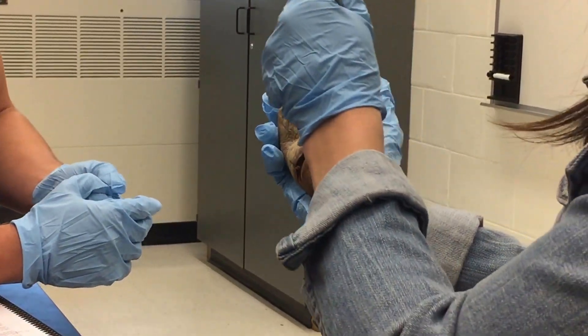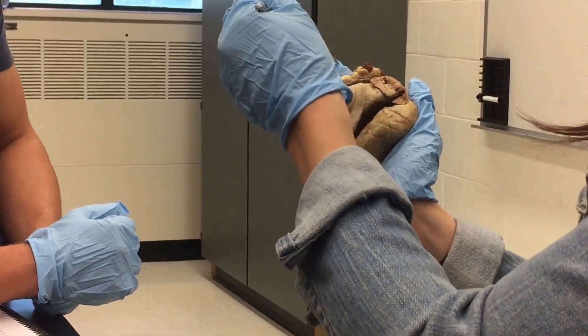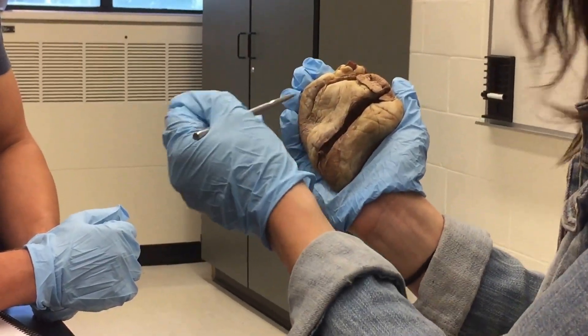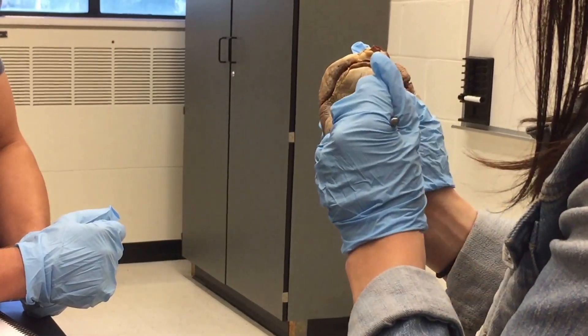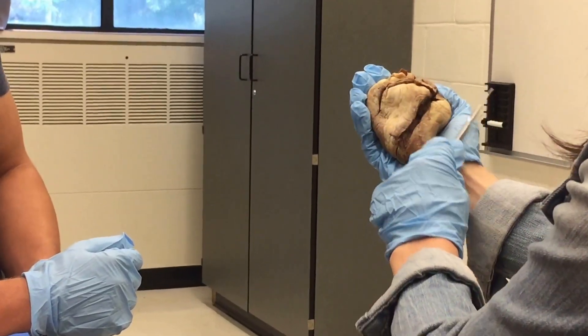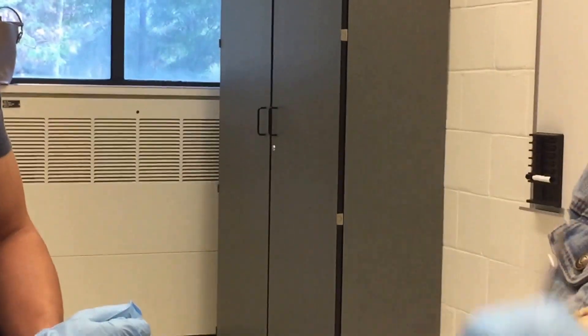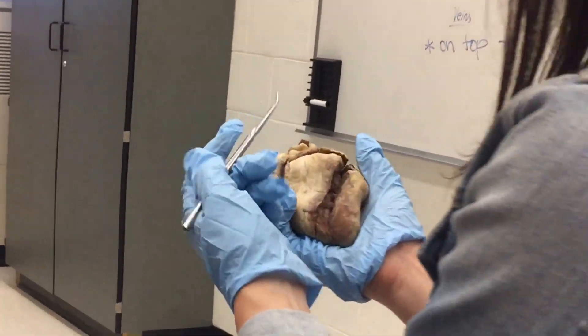Roughly speaking, you have your left atrium and your left ventricle, your right atrium and your right ventricle. If you're confused, the left side of the heart has a wall that is substantially thicker. Just know that if you're holding it, this is your left and this is the right side — the walls are a lot heavier than the other side.